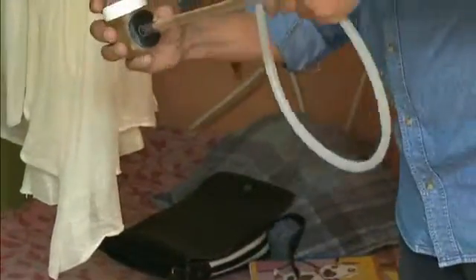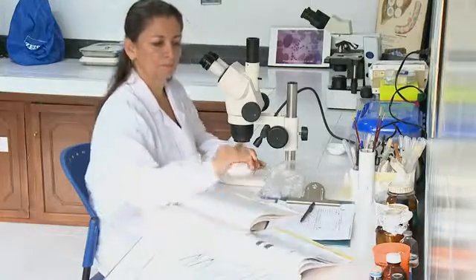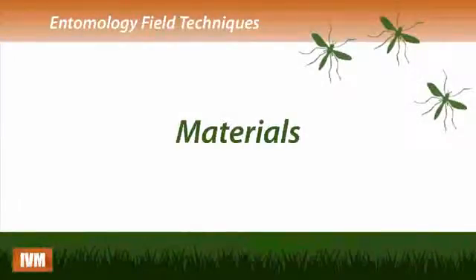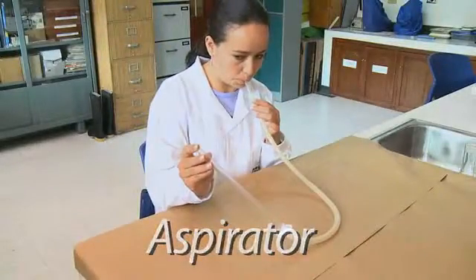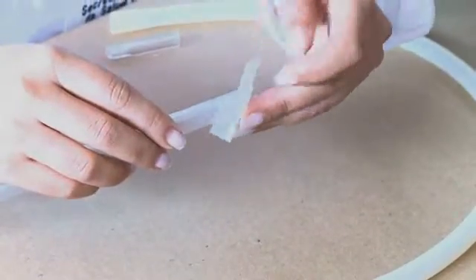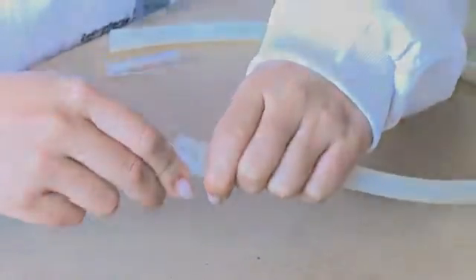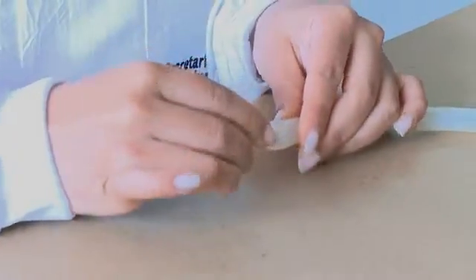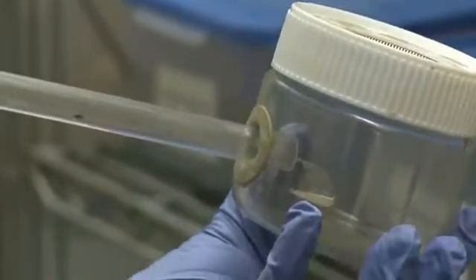During hand collection, both male and female mosquitoes and different mosquito species can be collected. Male and female can be separated from each other and identified taxonomically later on. The main tool used to collect mosquitoes by hand is the aspirator. A sucking tube, or aspirator, can be made locally using a transparent plastic or glass tube, a disc of wire mesh, a piece of rubber or plastic tubing, and a plastic mouthpiece. Aspirators are used to collect and transfer mosquitoes to holding containers.